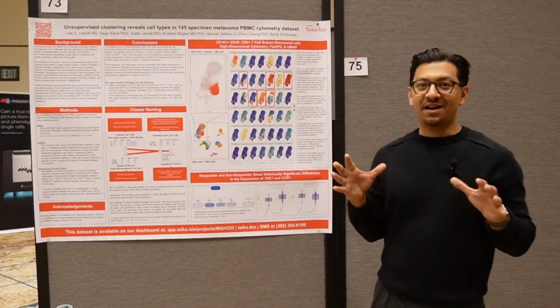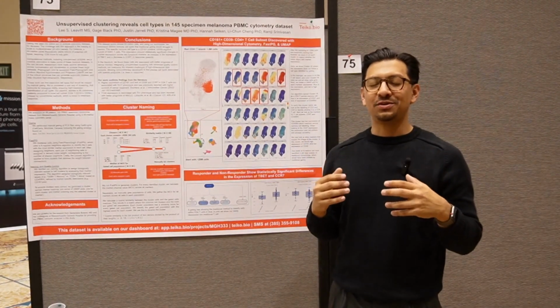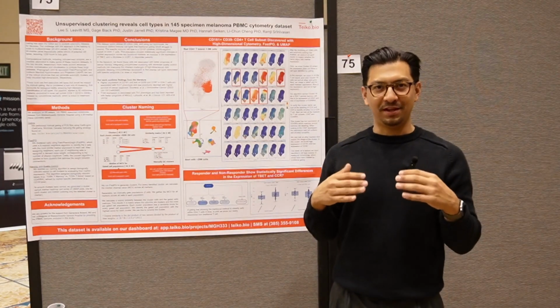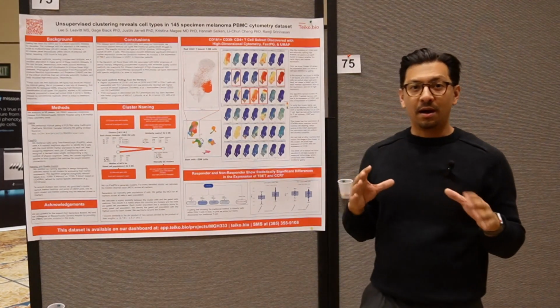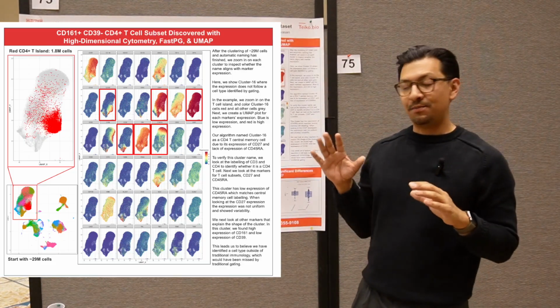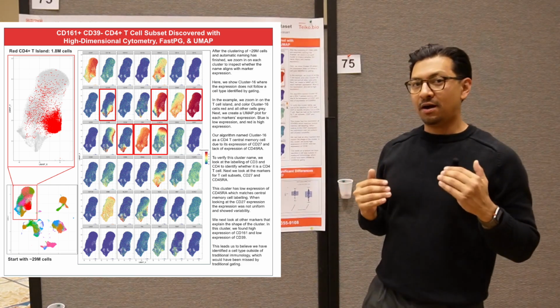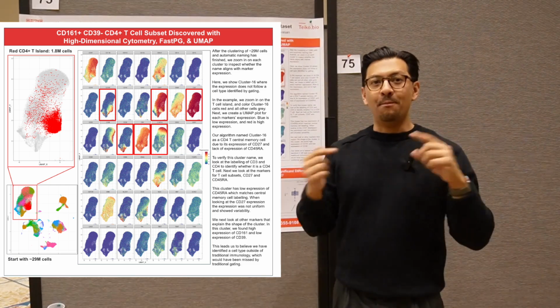The second part of our analysis was to see, by manually looking at each of these clusters, whether the name is actually defining them properly based off of the manually gated cell population. For a majority of them, it did. They worked out great. But there were a couple of clusters. For example, cluster 16, which is represented over here, looked a little bit off from what we saw in our manual gating and what the cosine similarity score matched up with.